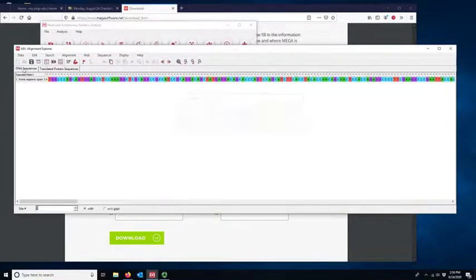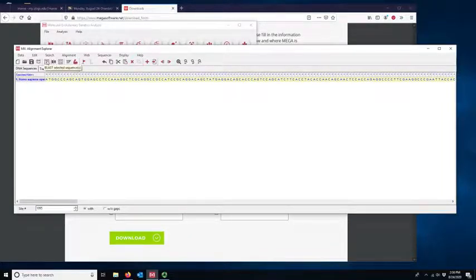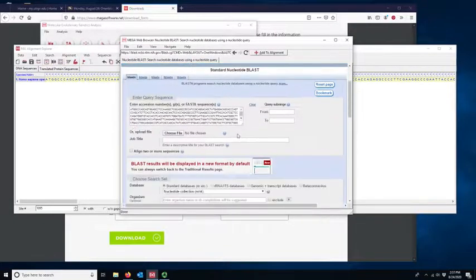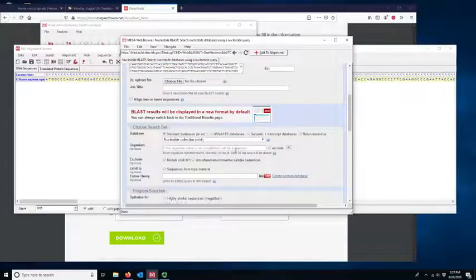I want to go back to my DNA view. I can even pick a single one like Homo sapiens, and there's a shortcut here. It's this one right here. That little icon is for blasting whatever sequences you've selected. And let's say I don't care if specifically that's a gorilla, but I want to add an additional primate sequence. So I could come into this one and say, okay, blast search that, but use primates.